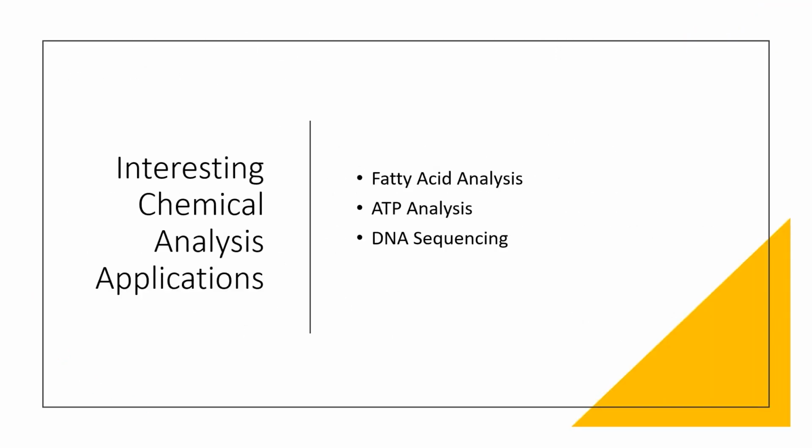All right, so just a couple other interesting things I'm going to mention, but not go into detail. We do have a lot of customers who run fatty acid analysis, which gives you a breakdown of fat chains in your wastewater plant. You can look at how broken down the fatty acids are, how many of them are full fat structures versus decomposed, and it gives you a sense of how the decomposition of fat is working. We don't see that as often. It's more of a specialty test, but it can produce some interesting results.